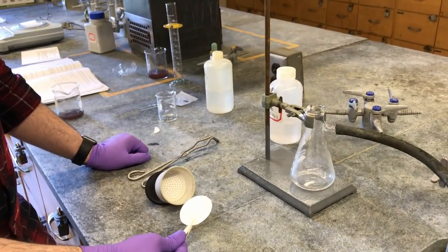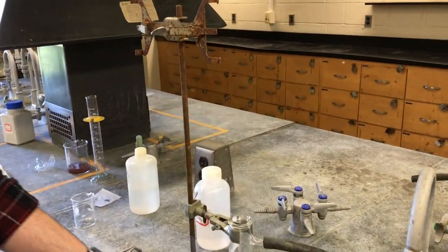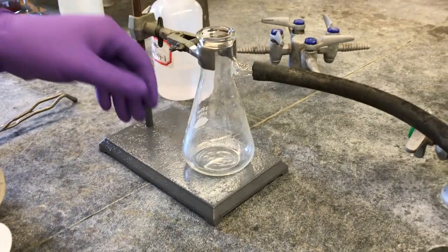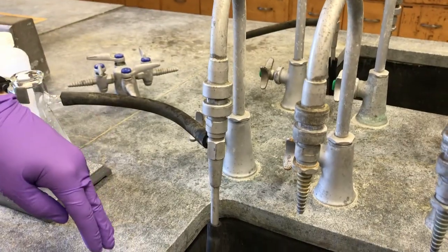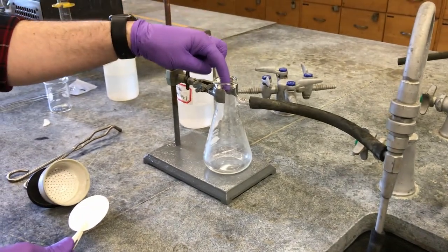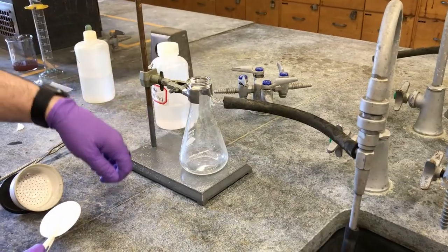So here's how you set up the Buchner funnel. We need a ring stand. What we've done is we've clamped our sidearm flask on here first, and then we have this hose that's attached to the sink. What'll happen is we open it up, water will come through and it'll form a vacuum, and it'll suck air in here, down through the hose.